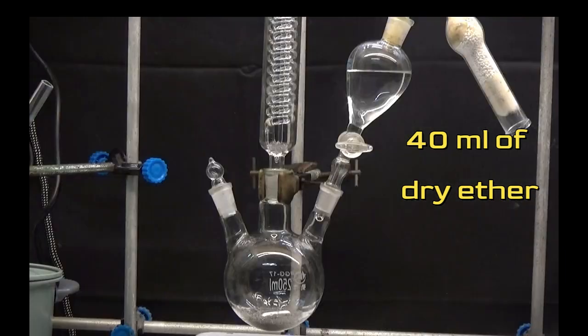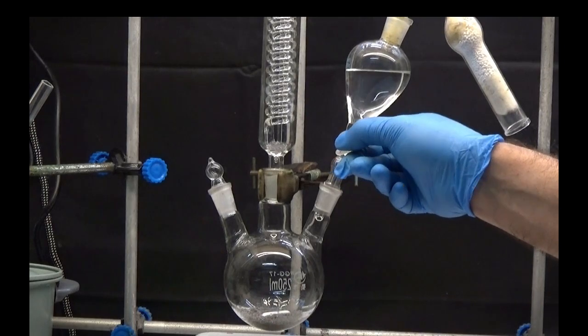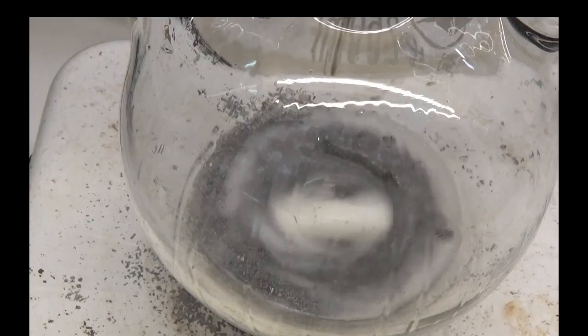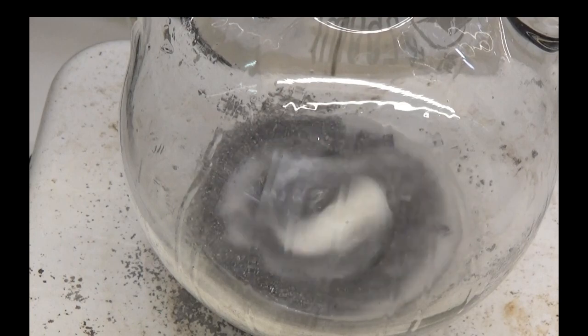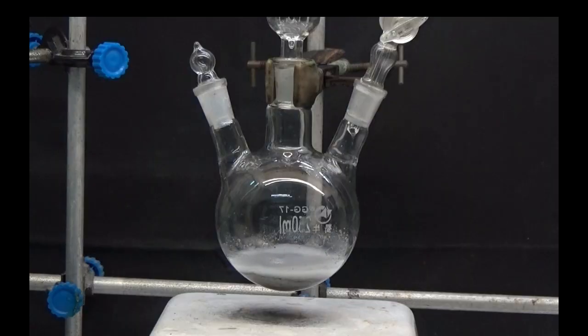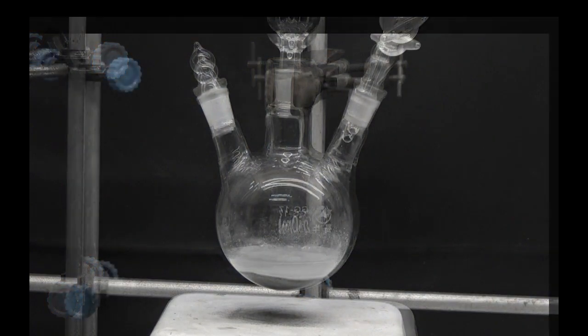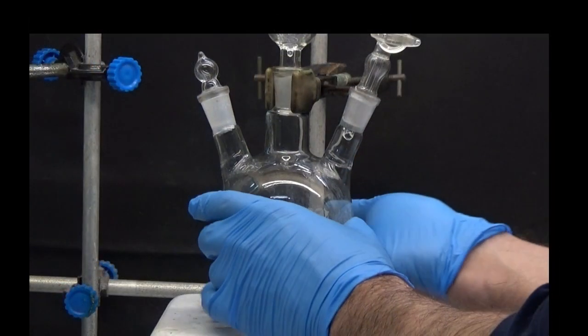slowly add 40 milliliters of dry ether, stirring constantly. If the boiling stops, warm the flask with your hand until the reaction begins.